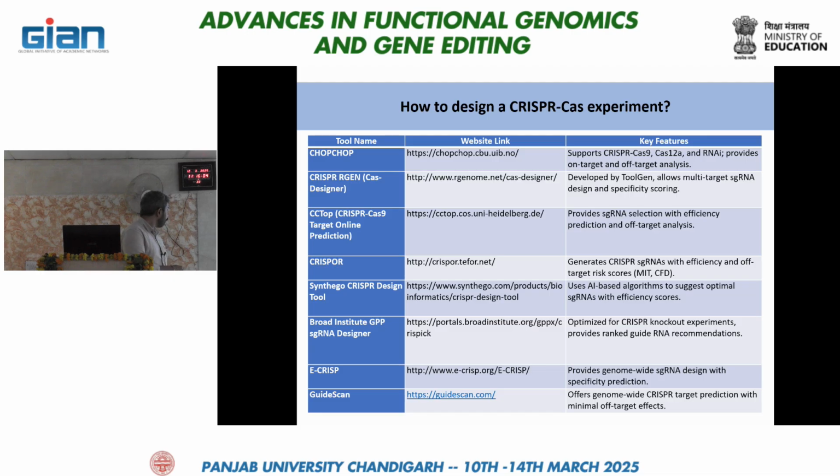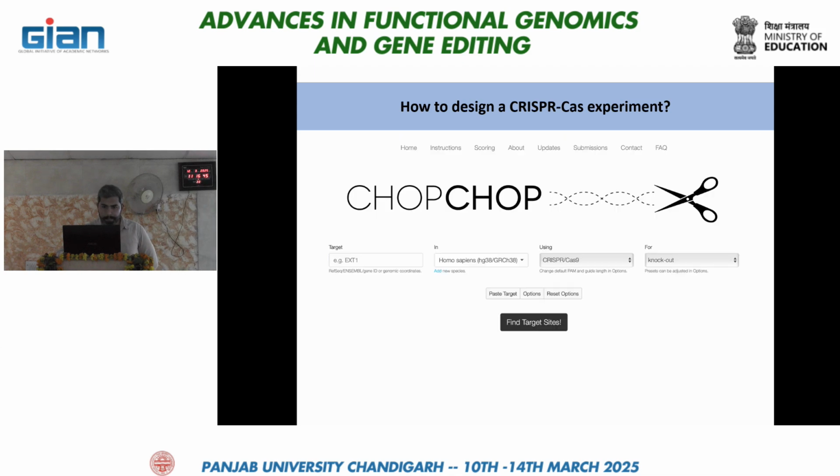So this is a list. These are some of the popularly used tools, like CHOPCHOP, CCTop, CRISPOR, and the Synthego CRISPR design tool. These are different tools, and they all have different key features which you can study later. Like with some of them, you can only submit your target gene with up to a 500 base pair limitation, and some give a better graphical projection of your target genes. So we'll come to this later.